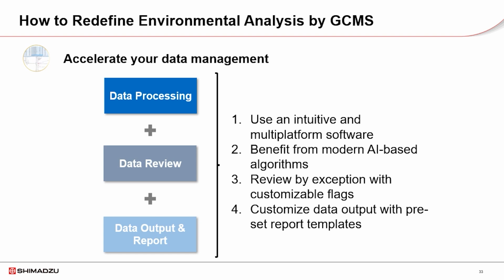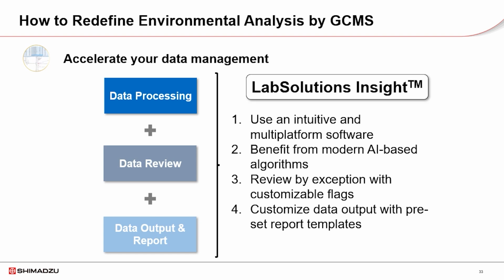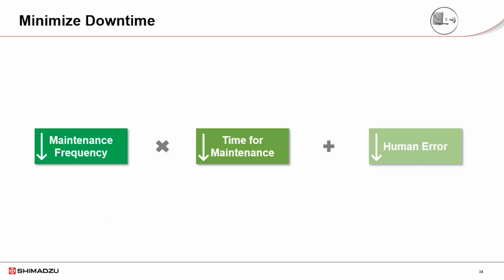And now, Yoshiro, the last topic. Downtime in the lab cannot be avoided. The same way you need to stop to put gas in your car or charge the battery if you have an electric vehicle. So how is the new technology in GCMS helping us with minimizing downtime?